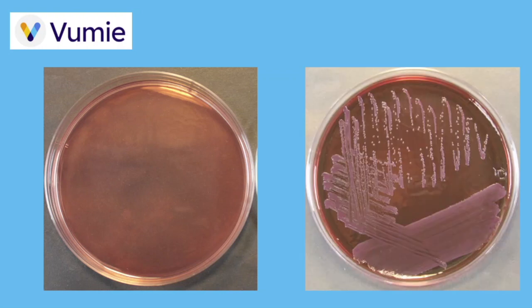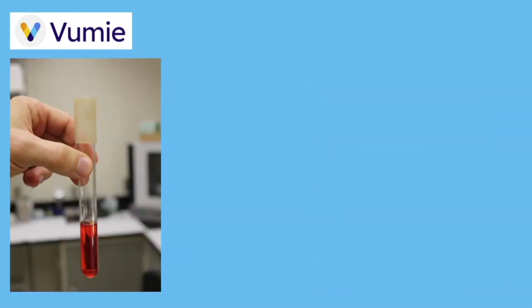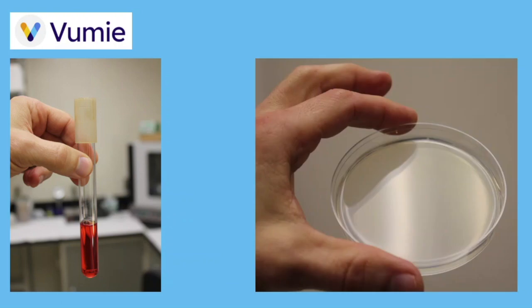studied. Bacterial growth media can be liquid or semi-solid, nutritionally rich or poor, modified by the addition or removal of key nutrients, all in an attempt to give us the tools needed to find out more about our unknown microbe. Here are some terms and definitions and facts about media.